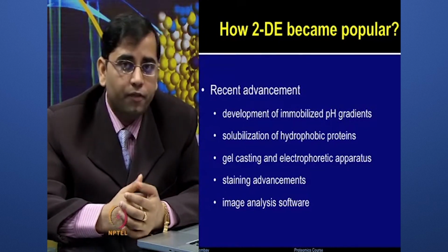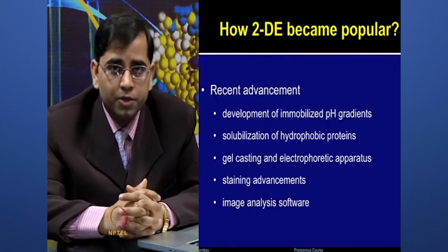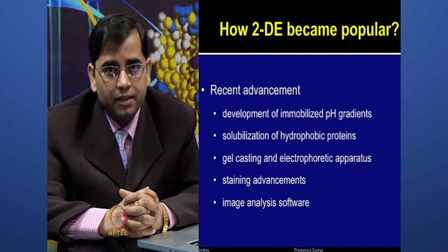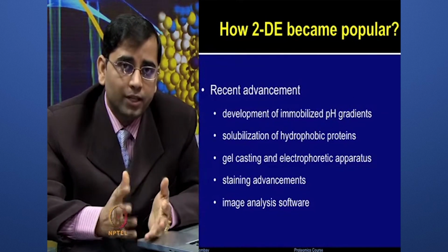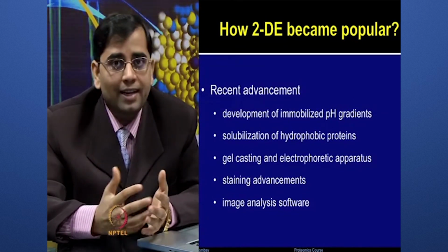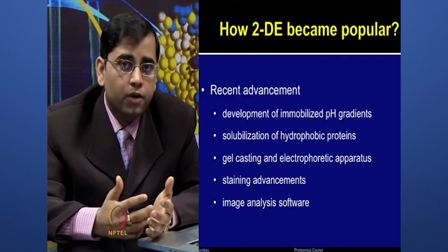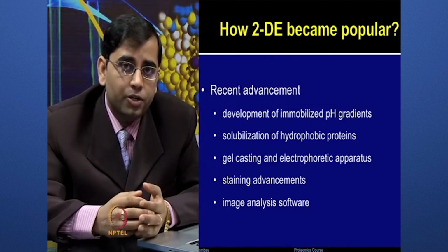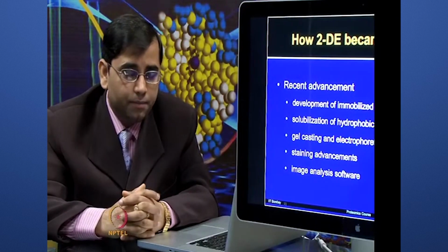We will talk about different types of stains and how they work during the course of the two-dimensional electrophoresis workflow, but very sensitive stains spearheaded this process to visualize the proteins on the gel. Finally, how to analyze the images obtained from these gels. That was one of the major advancements. Different types of software and image analysis tools came into play to analyze the gels.